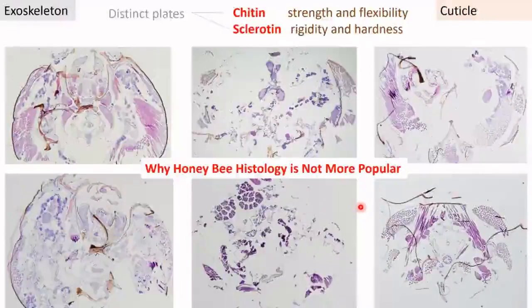It's important to note that for our tissue preparations, we fix our honeybees in formalin. The tissues are then processed in a regulatory WCVM veterinary diagnostic laboratory, Prairie Diagnostic Services, PDS. We embed our tissues in paraffin, section them ourselves at 4 or 5 microns, and stain them with regular hematoxylin and eosin stains. All of the histologic images shown in this presentation were obtained by a number of graduate students in our lab over the last 5 years.